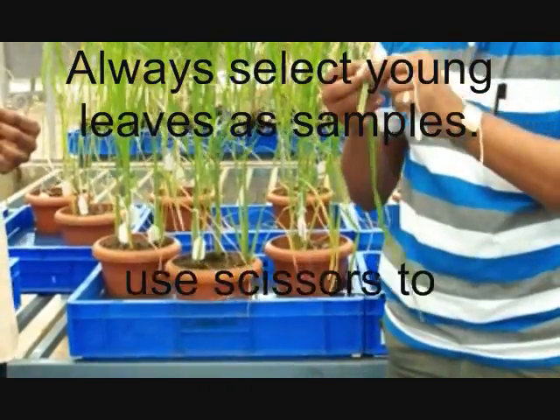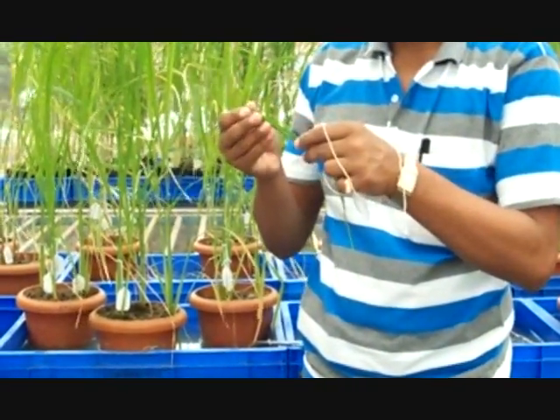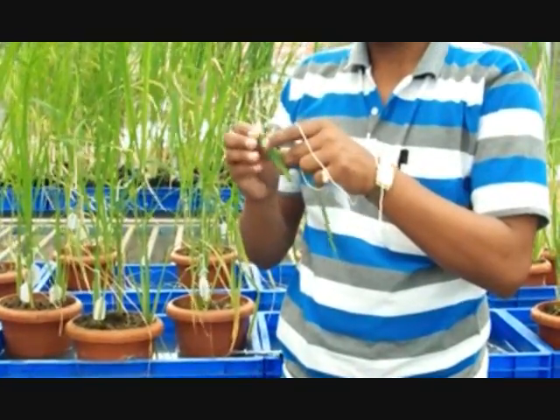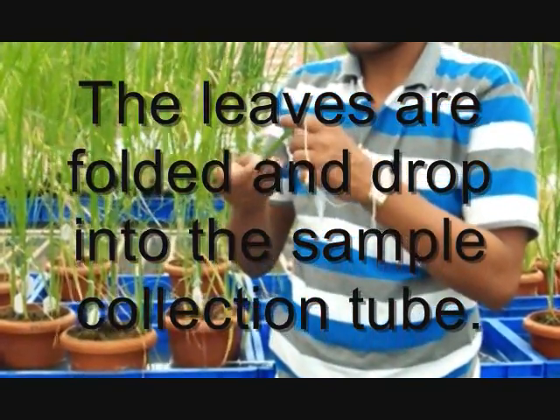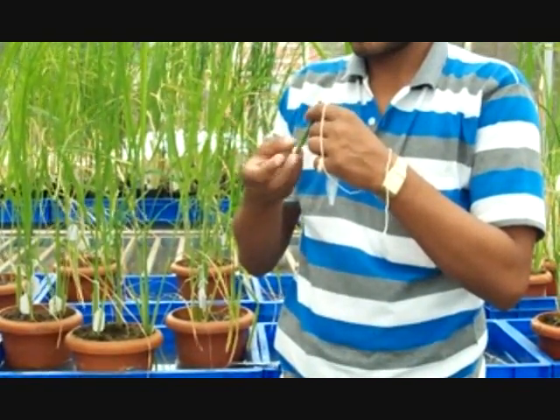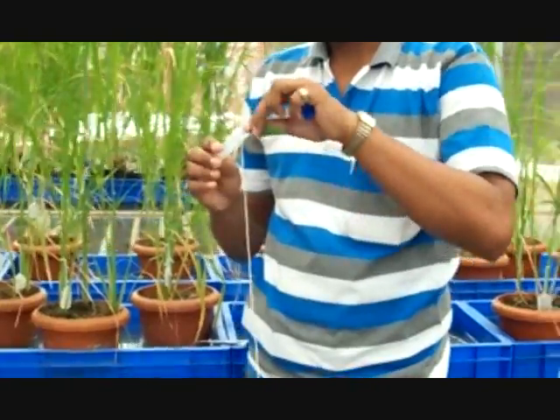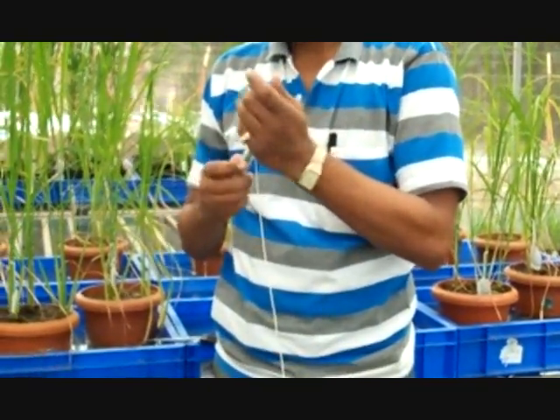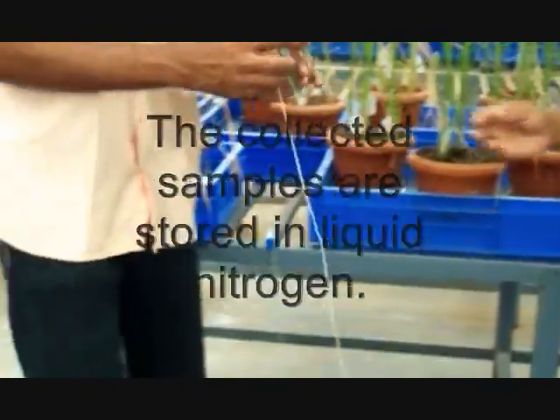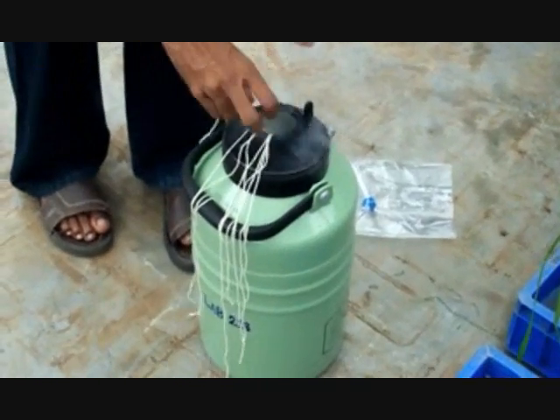Always select young leaves as a sample. Use scissors to cut the samples. The leaves are folded and dropped into the sample collection tube. The collected samples are then stored in liquid nitrogen.